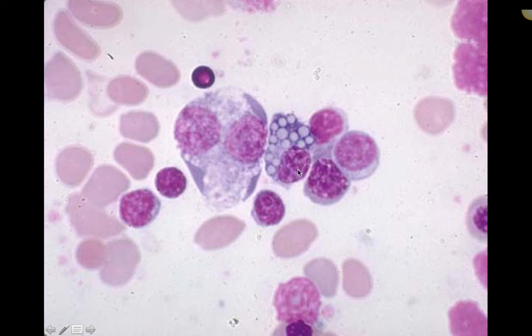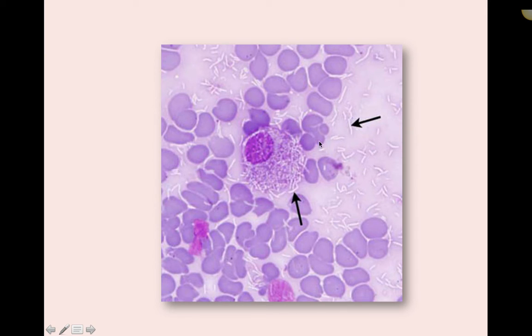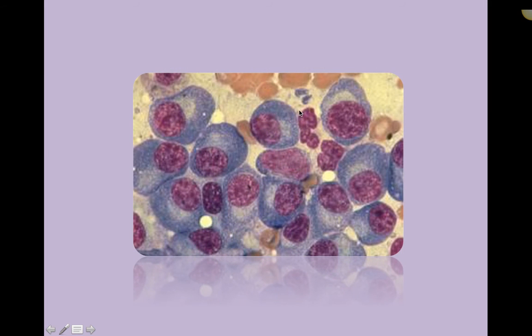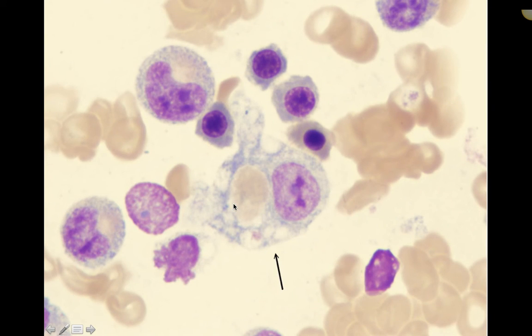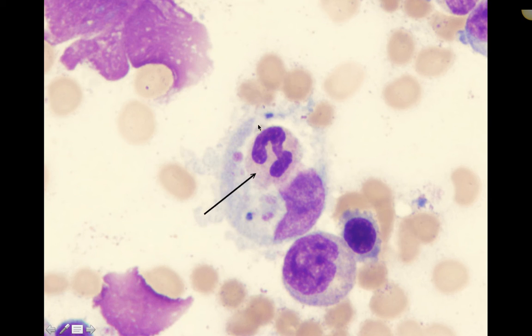Here are some practice slides. We have a multinucleated macrophage, medium lymphocytes, small lymphocytes, and a mott cell. Here we've got lots of rod bacteria, a macrophage, and red blood cells. These are plasma cells with that perinuclear clearing, along with neutrophils, red blood cells, and a lymphocyte. These are happy plasma cells — they always remind me of a person with really big hair. And here you have erythrophagocytosis, and here hemophagocytosis.